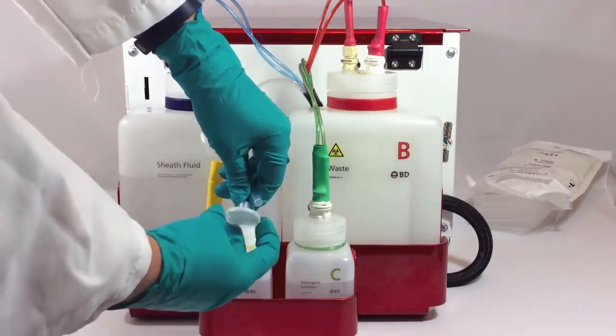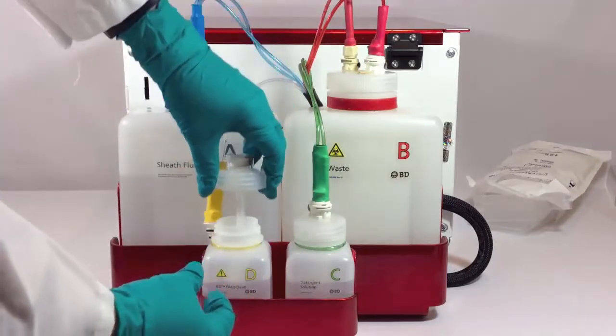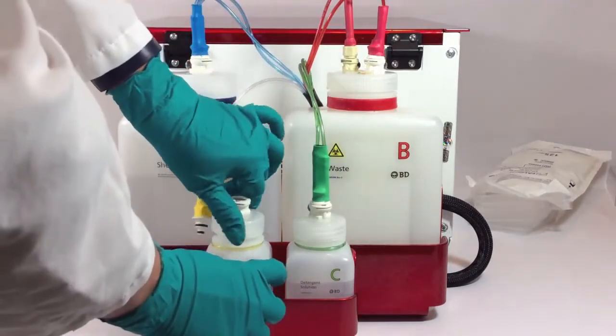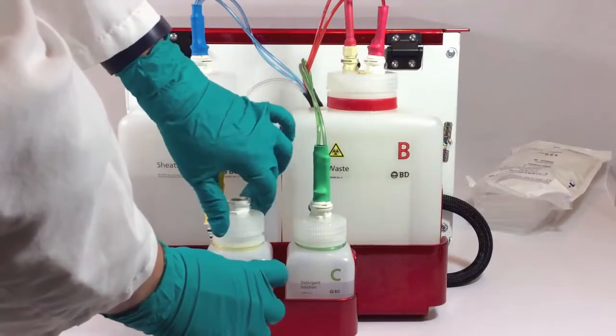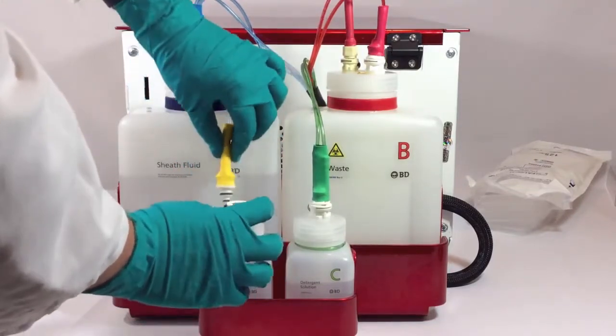Connect a new filter, reassemble the bottle, and reconnect the Quick Connect line. Then repeat the steps for the remaining bottles. Note that the waste bottle doesn't have a filter — that's why you only have three filters in a maintenance kit.